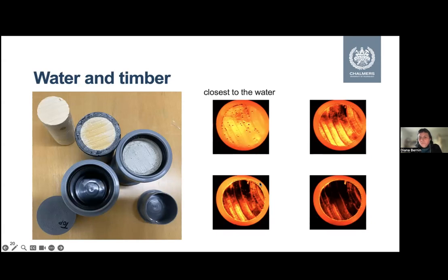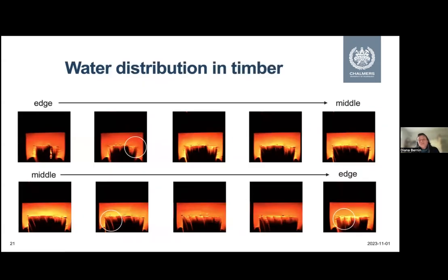It would be very interesting to understand why in some regions there is more water uptake, whereas in others there is not. And here you can also see air bubbles. So this is a start. This project has only just started, so we don't have many results yet, and it's not so easy to measure on concrete as such.